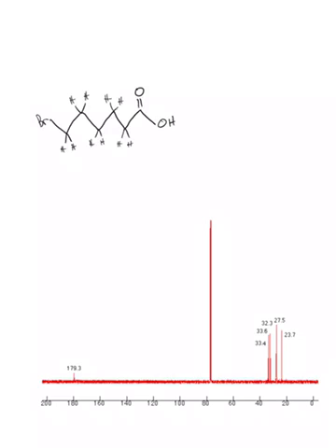So next we will analyze carbon NMR, and it is important to note that for carbon NMR, the peaks that are shown on this graph, so as we can see here, we have 1, 2, 3, 4, 5, 6 peaks, correspond with the number of carbons that are present in your structure. So if we recall, our structure had a chemical formula of C6H11O2Br, so clearly the 6 carbons correspond with the peaks that are shown here.